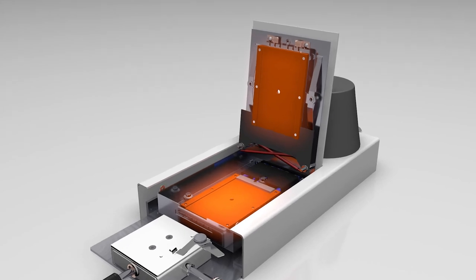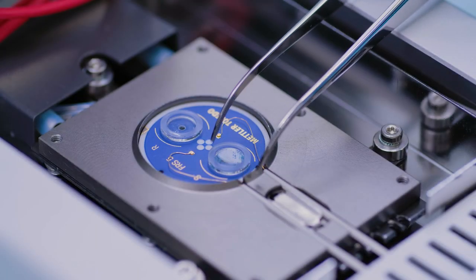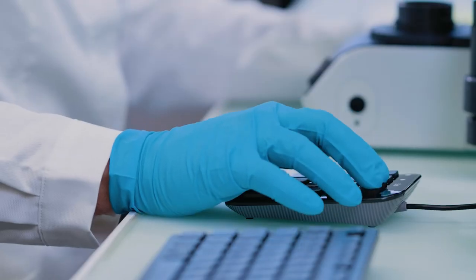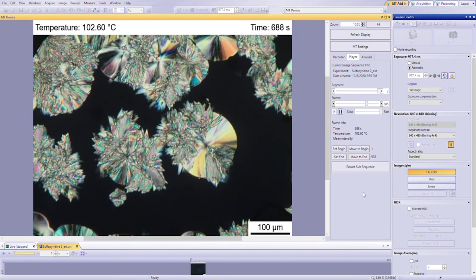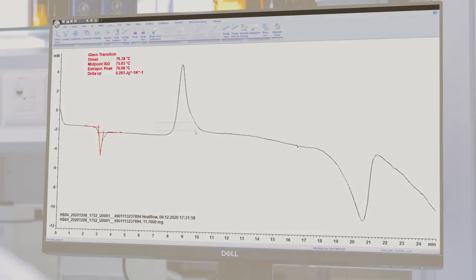With all these features, METTLER Toledo's excellence hot stage systems are accurate, simple, and versatile solutions for visual examination of all kinds of thermal transitions.